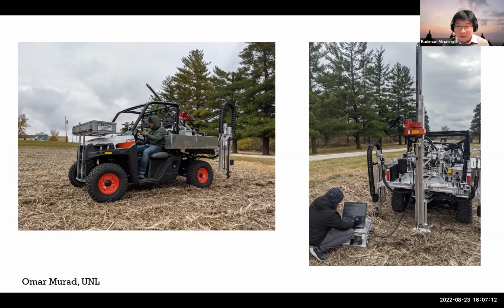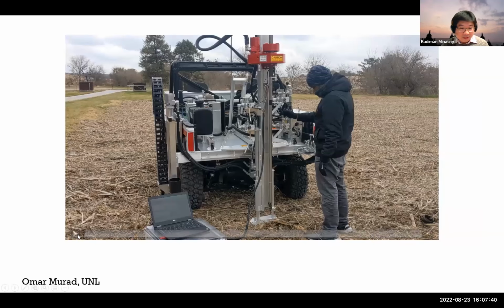So this is Omar. Omar is our ex-PhD student, and he's now at University of Lincoln in Nebraska. He drove around with this rover, and it's not quite a moon rover, not quite the rover that we see, but it's still manually operated. What he is doing is, it has a sensor attached to it. And when he stopped, he did this kind of thing, the noisy thing.